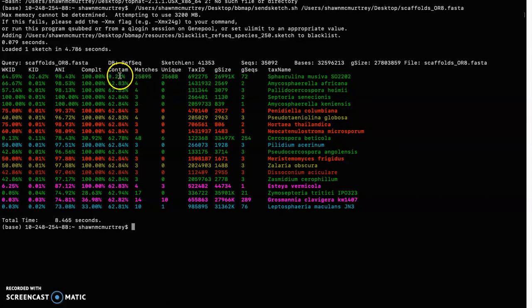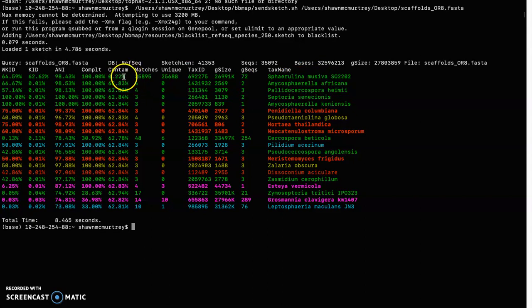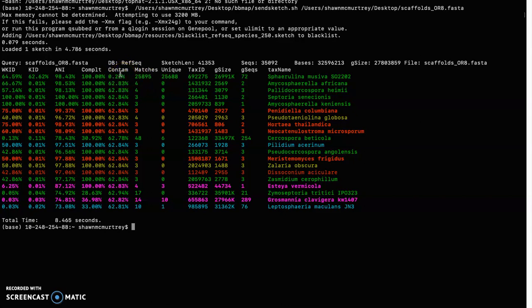Compared to that genome we have 0.22 percent contaminants, so that's pretty good. I would say probably anything less than like three or five percent would be good, so 0.22 percent is really good.